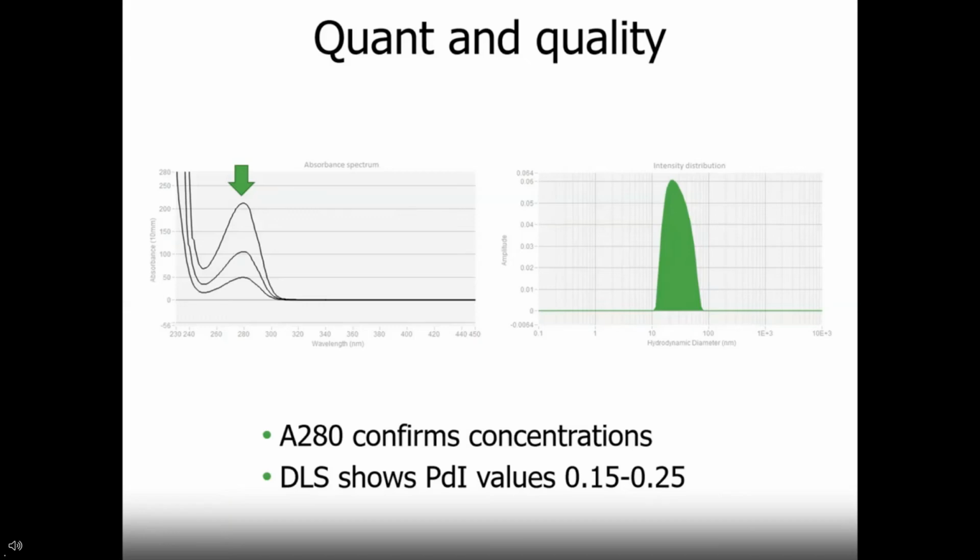We'll also note that for the graph shown on the right, the correct size values do actually need the viscosity data from Honeybun fed back into the system so that we know the right size for things based on the viscosity that they have in solution.